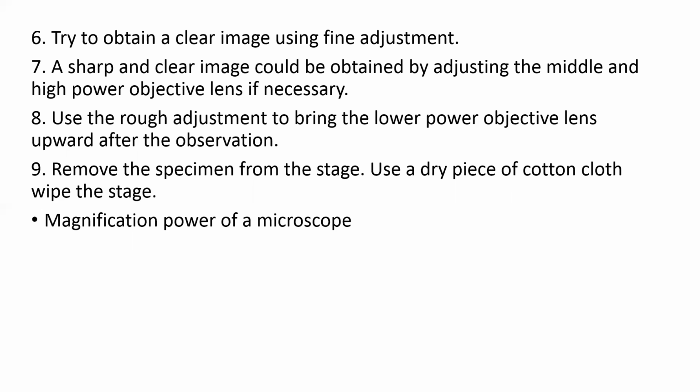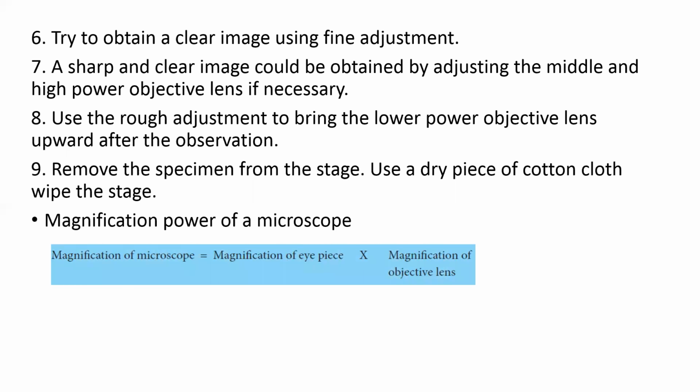Magnification power of a microscope. We can find the magnification power of the microscope by using this equation. Magnification of a microscope equals magnification of eyepiece times magnification of objective lens.